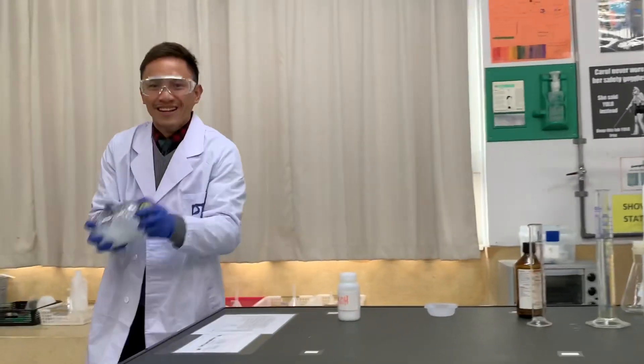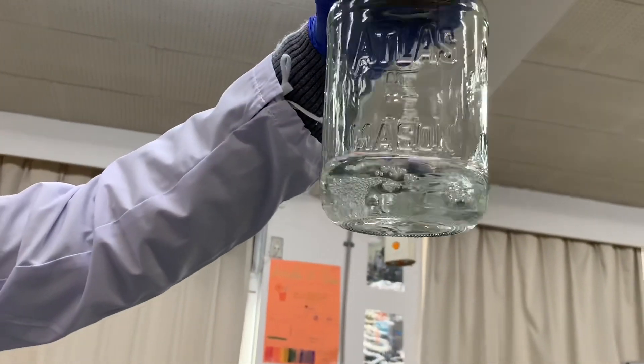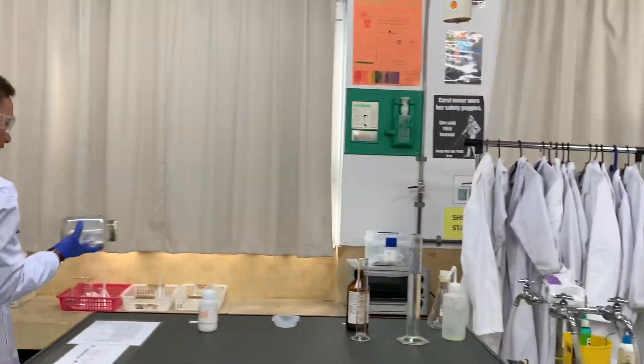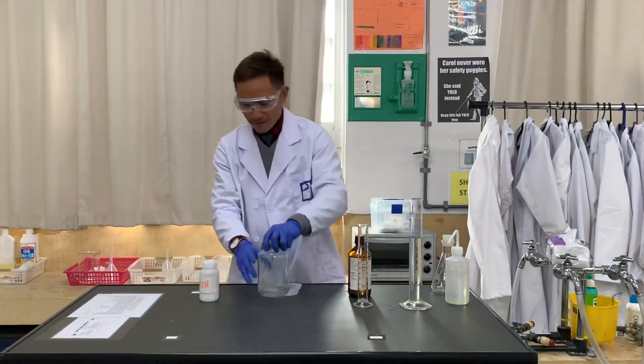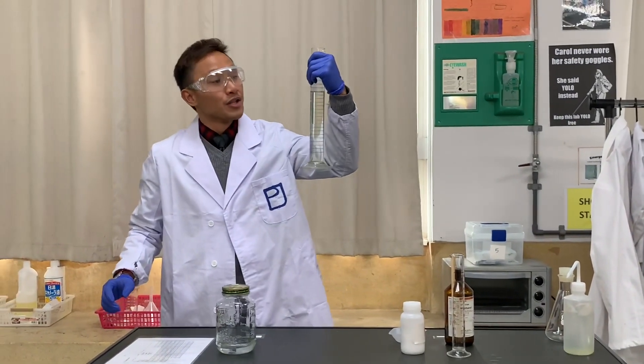There is no more solid underneath, so basically all the potassium hydroxide has been dissolved. That's what we want — that's the preparation. The next step is we're going to take 200 milliliters of our cooking oil.